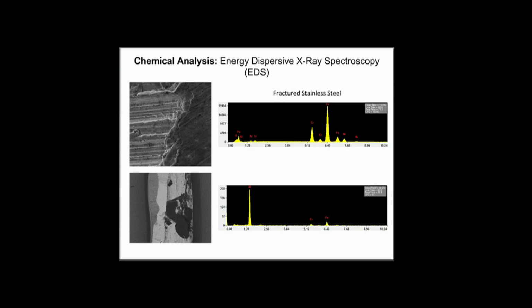On the bottom, you see different contrasts, and this is a mode where you can get qualitative data or qualitative information based on the size of the nucleus of your elements. And you can talk about theory and go further into that, and we can help you with some of that theory. And then on the right is actually the spectroscopy.